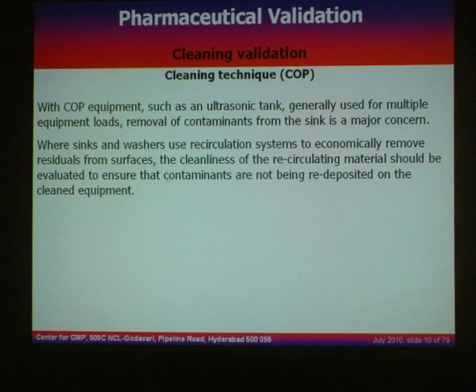Where sinks and washers use recirculation systems to economically remove residuals from surfaces, the cleanliness of the recirculating material should be evaluated to ensure that contaminants are not being redeposited on the cleaned equipment.